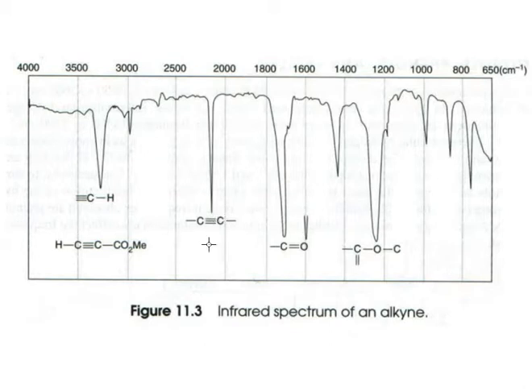On the other hand, if we were to examine the absorption peak for the carbon-carbon triple bond stretch of a different alkyne which had nonpolar groups on it, what we'd find is that that peak would be a lot smaller, because in that particular case with nonpolar alkyl groups there isn't a very large change in polarity during the course of the vibration.